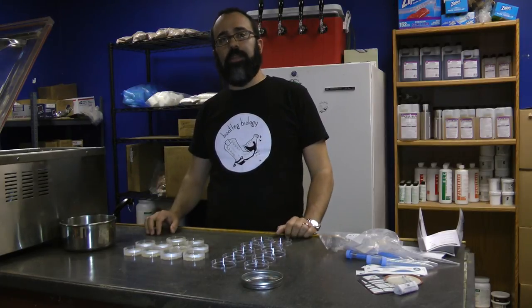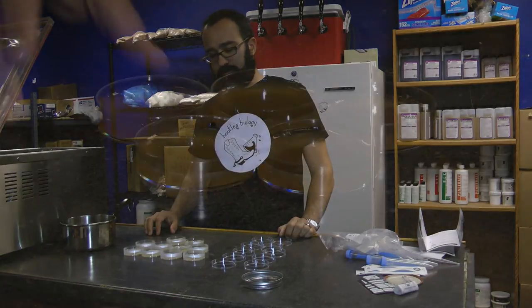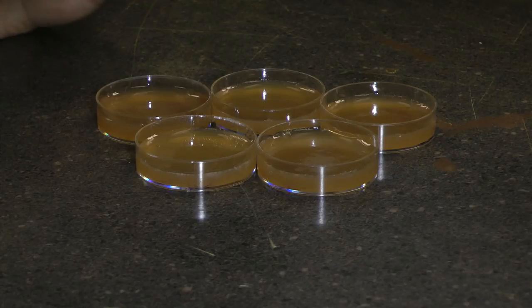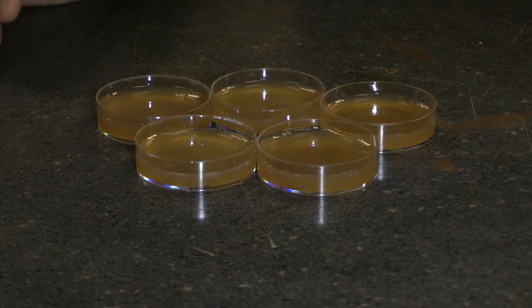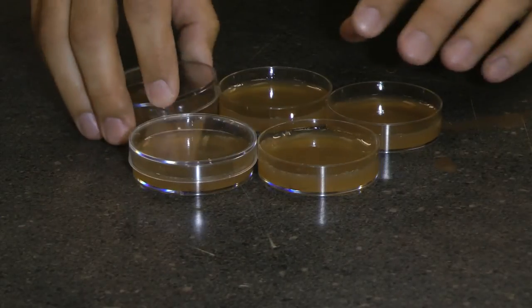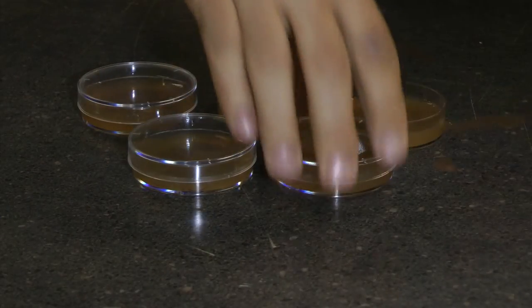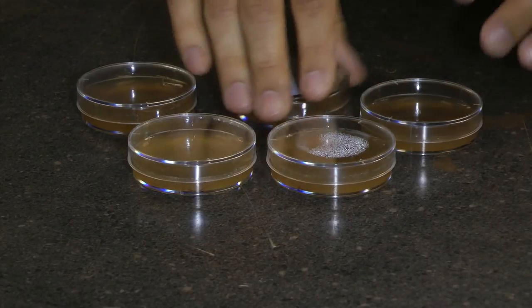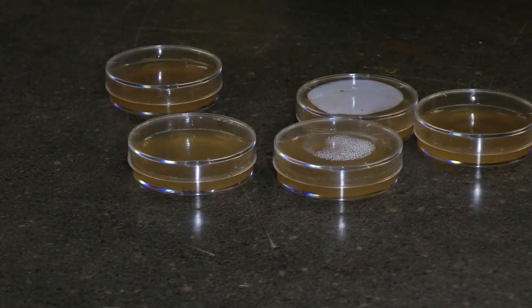Once you're done, you're going to incubate the plates. So you've let the plates cool and now they've set — they're going to be solid like gelatin. At this point, you just need to put the lids back on and then wrap them in the parafilm. You're going to stick them in the fridge and turn them upside down. Then you'll take them out when you're ready to use them.